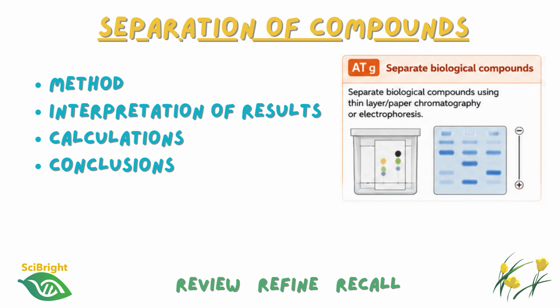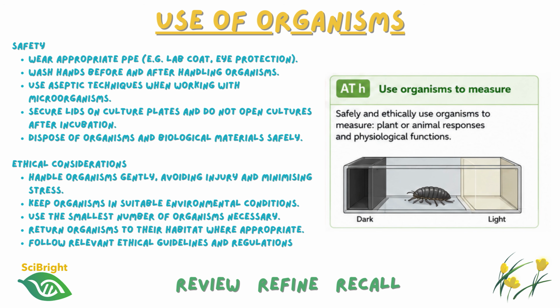Gel electrophoresis is commonly used to separate DNA fragments according to size and is learned about in the gene technology chapters. If you are lucky enough to have Amgen project running in your school, you'll get some hands-on experience using electrophoresis to perform your own DNA fingerprinting, and I highly recommend it.